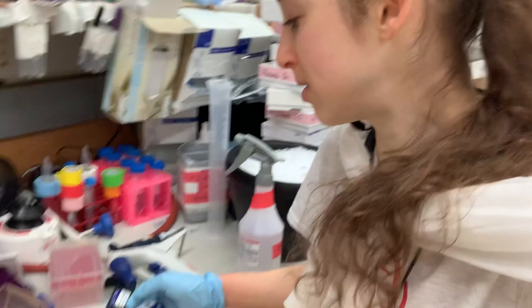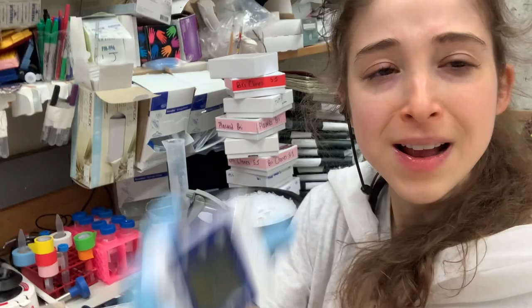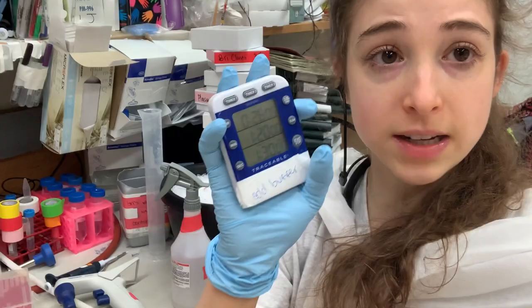We're going to have things like pipettes, centrifuges, all this various stuff. I wanted to reboot an old post, refresh it, extend it, and give you information that's going to equip you for experiments in biochemistry, so that you know what's what in a biochemistry lab. Some stuff I forgot before — like how could I leave out the timer, which right now is telling me I have 26 minutes until my next step. So let's get started.